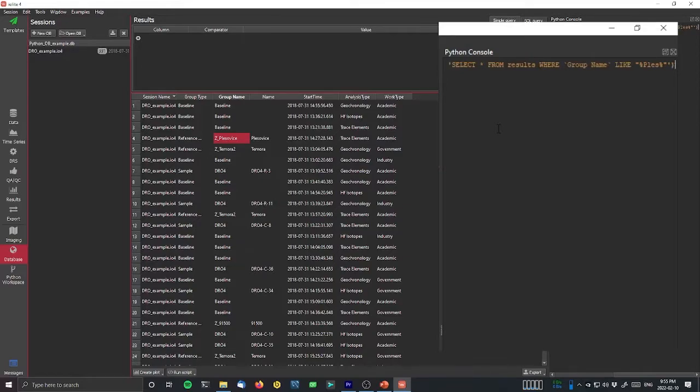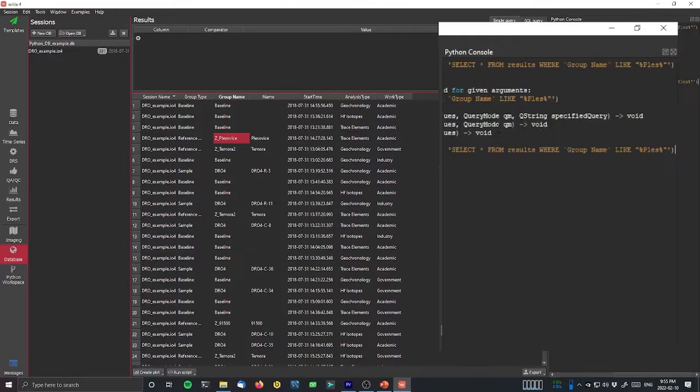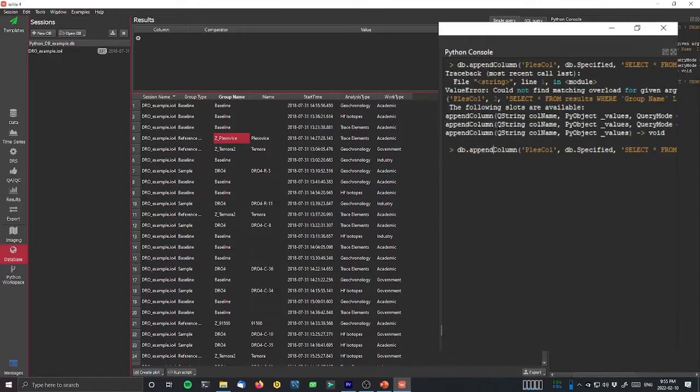Close that out, and I did a typo in there. Oh, I forgot to pass the actual array as well. So I've given the name, but I forgot to give the values, which is our new vals array.